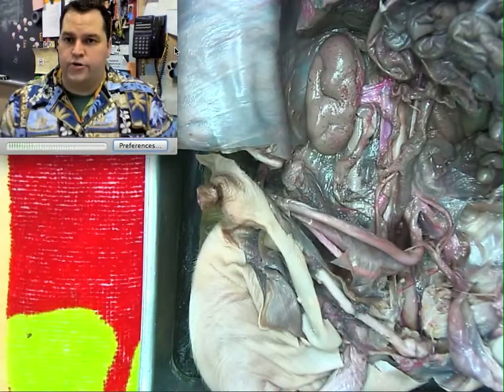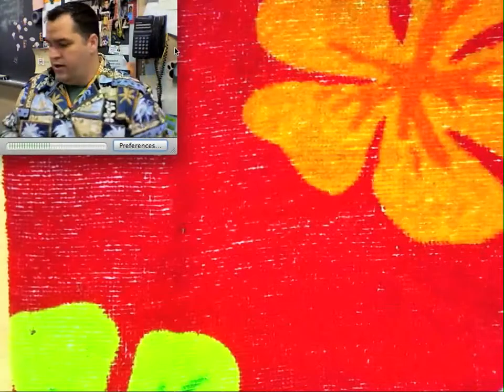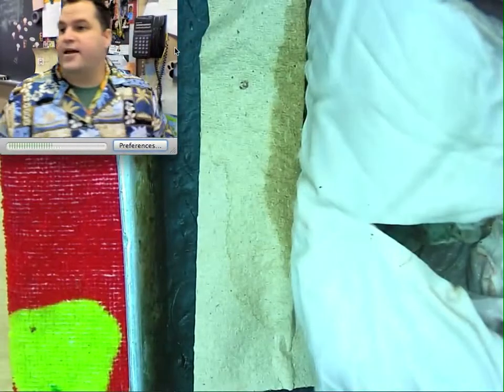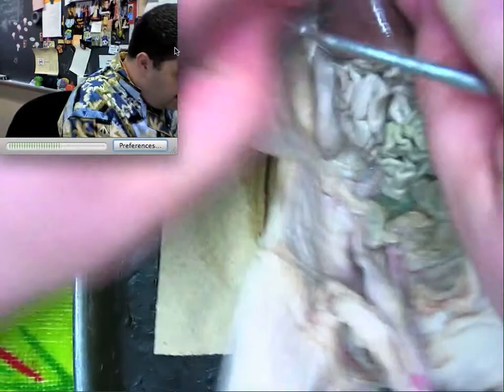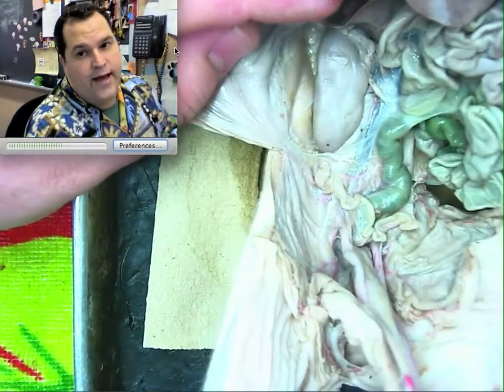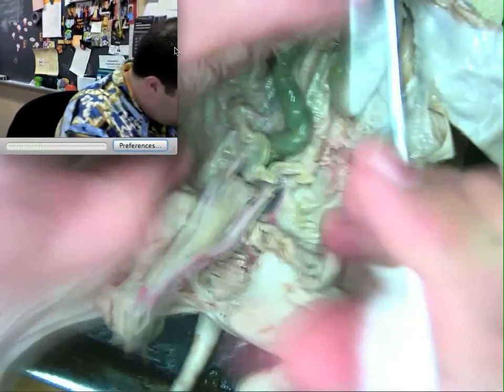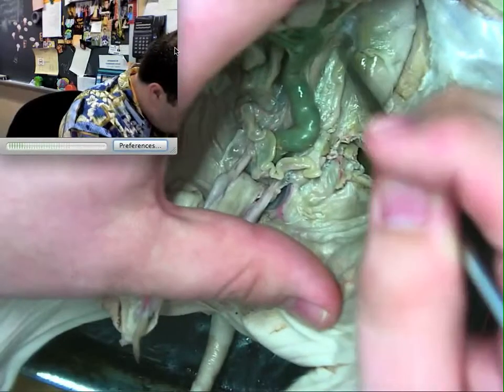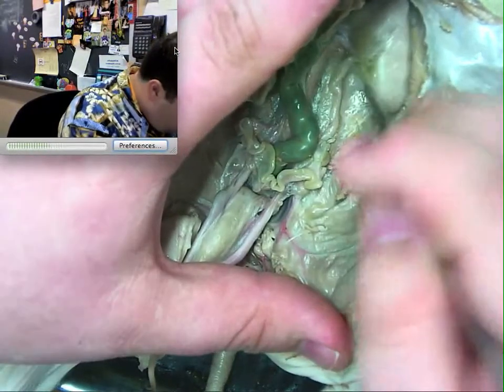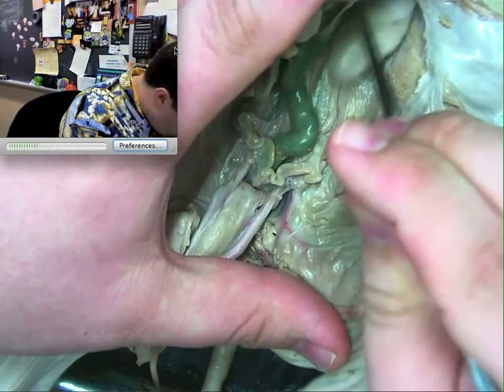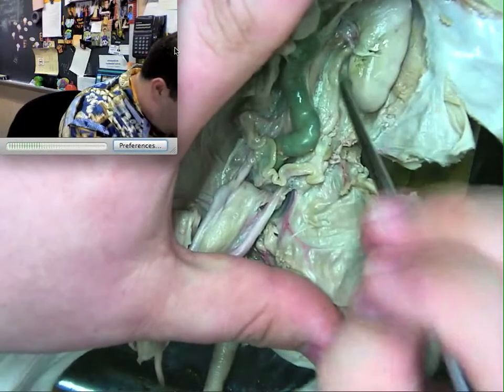We'll review that one more time with a diagram, but first let's get into the female structures. Remember, kidneys are bilateral — there's one on each side. So let's look at the left kidney on our female specimen. There's a color difference, but some of the membrane on this one is still attached, which shows you the membrane that holds the kidney in place. Moving that out of the way, we start to eek away at the tissue around the entry point.